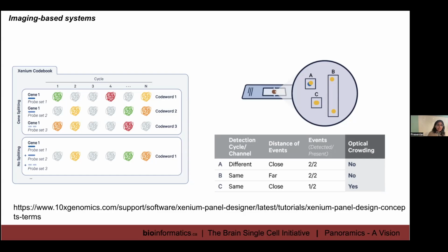So every single point that you see on a CosMx, on a Merscope, on a Xenium, just know that it's a prediction. Remember a few lectures ago, I talked about how these sequential images are not open source, and only Merfish, only from Merscope, is open source. What is the value of making these available to you? Because there are different ways to analyze these images and to predict these molecules. So that is how.